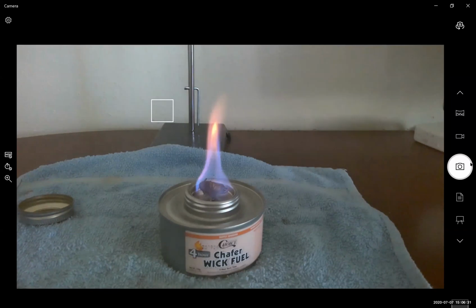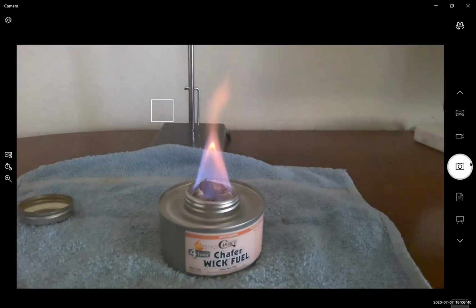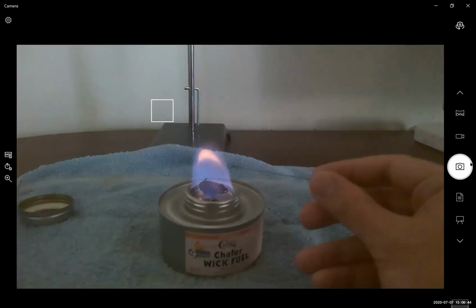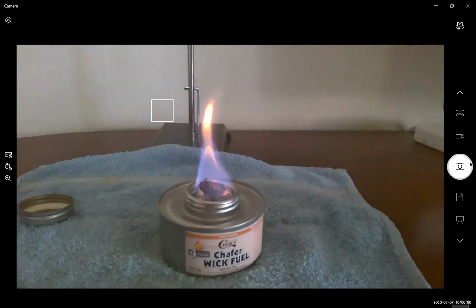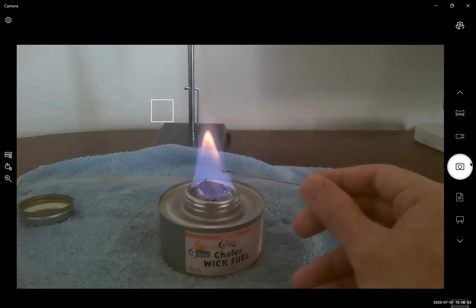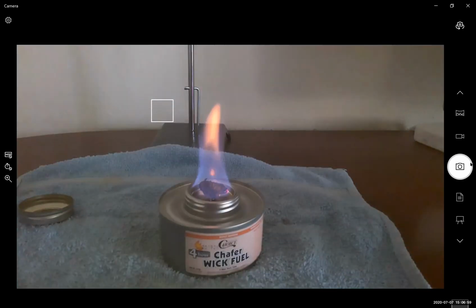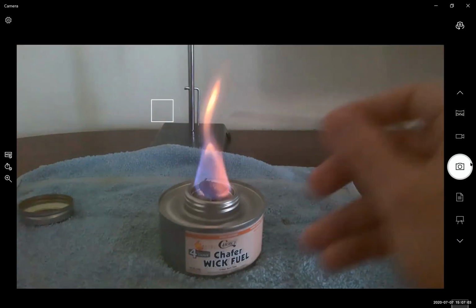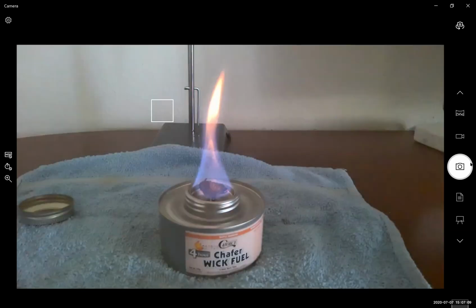So I made it a little bit darker in this room. Let's see if we're able to pick up on this. This is potassium one more time, this time when it's a little bit darker. Let's try it one more time. Does everyone see that pink overtone? It's like a cotton candy color. Yep. A pink purple overtone. If the solution's concentrated, you'd see this super bright purple.